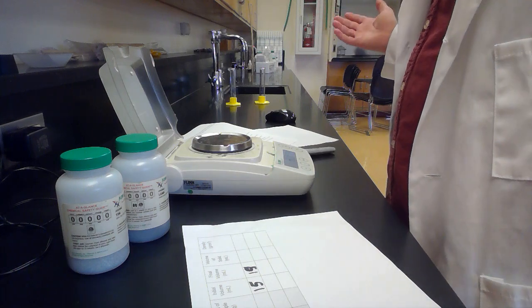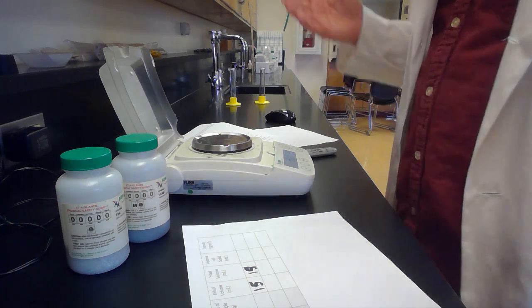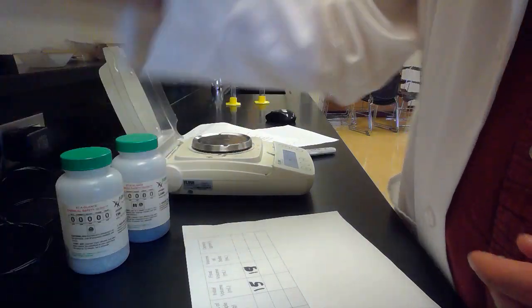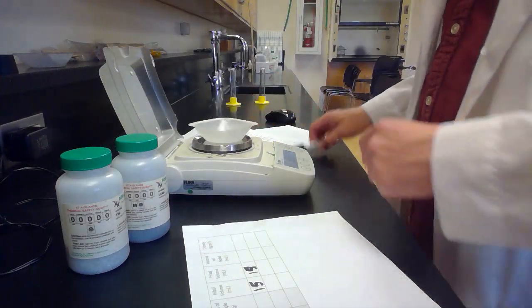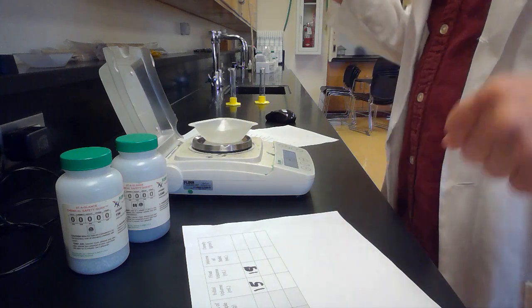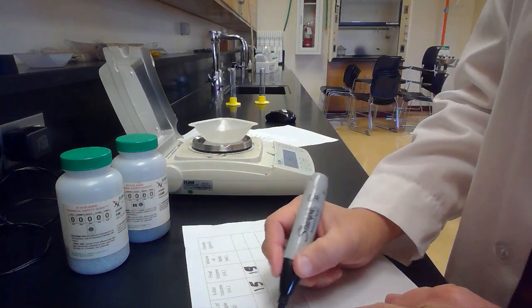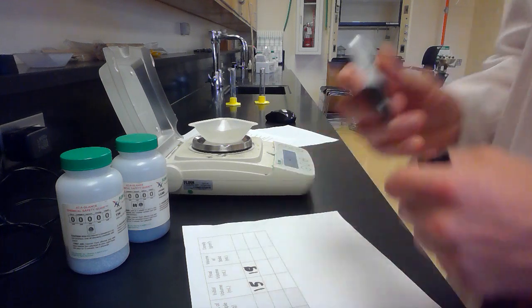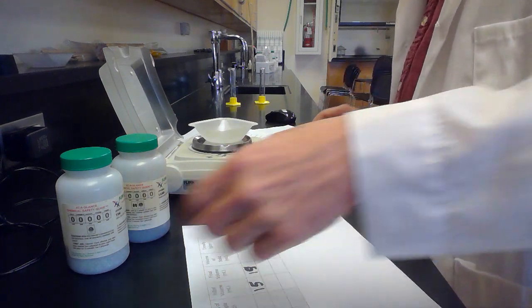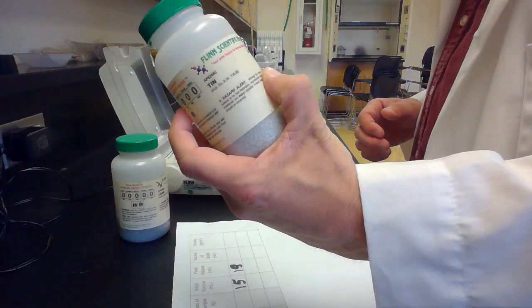Now we got to repeat all of these steps using tin instead of silicon. So I'm going to, again, take my weighing dish. I'm going to put it on here. This one weighs 2.55 grams. So I'm going to put that under mass of beaker, 2.55. Now we want to get about 8 grams of tin.